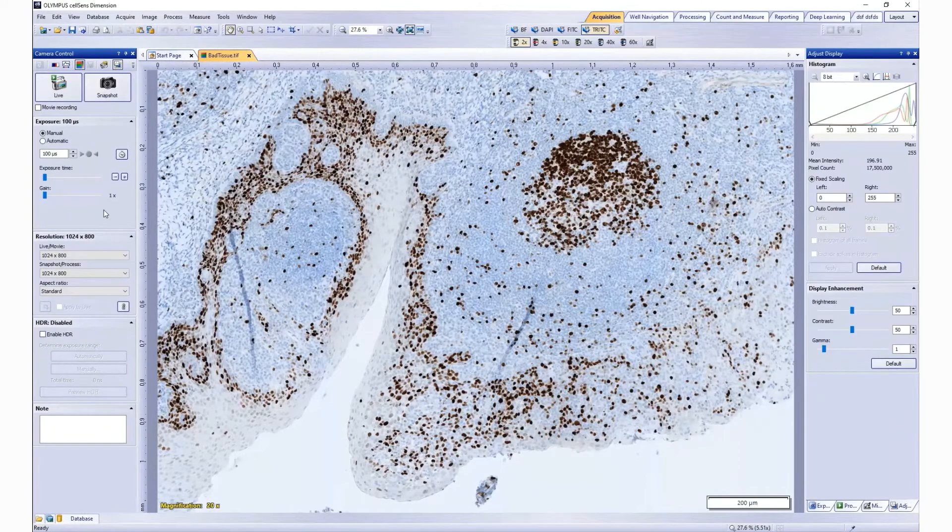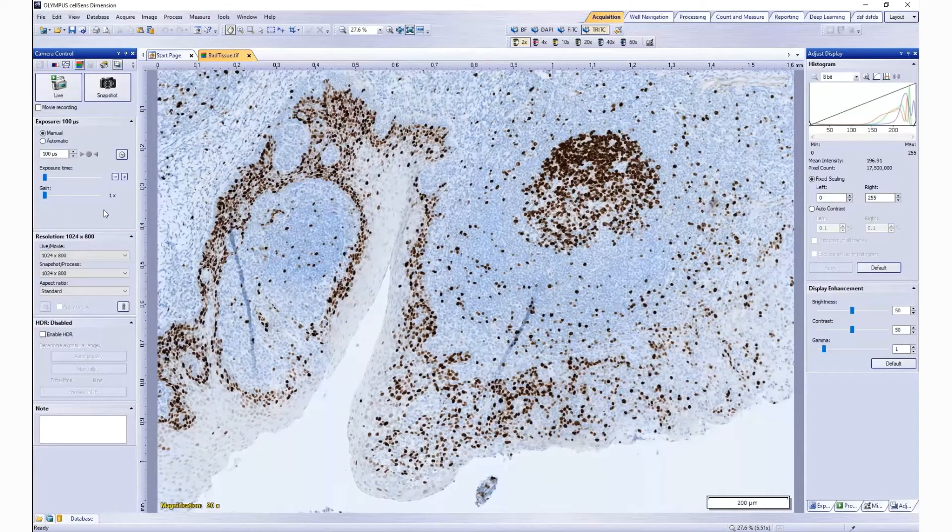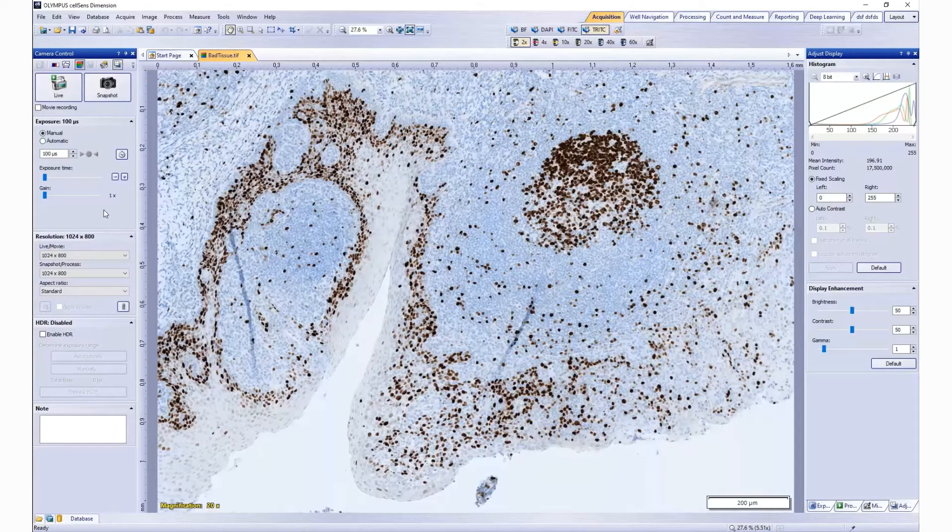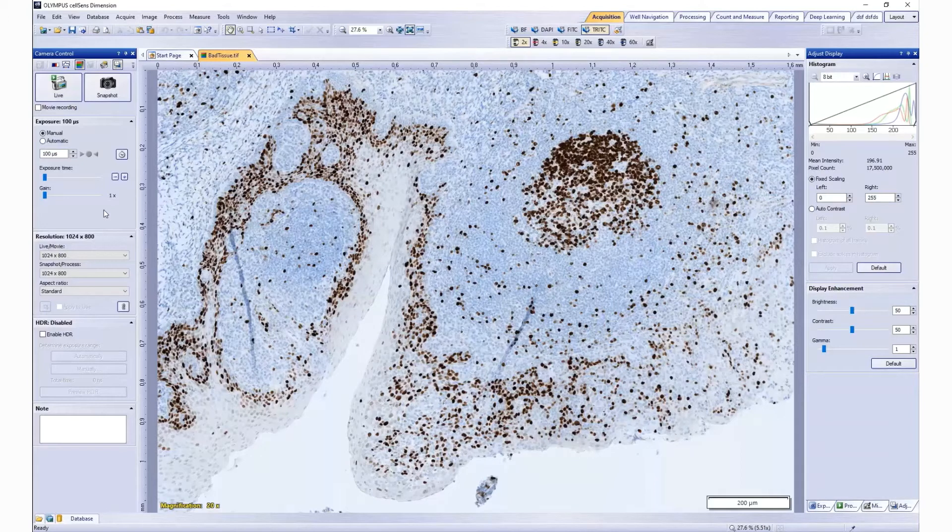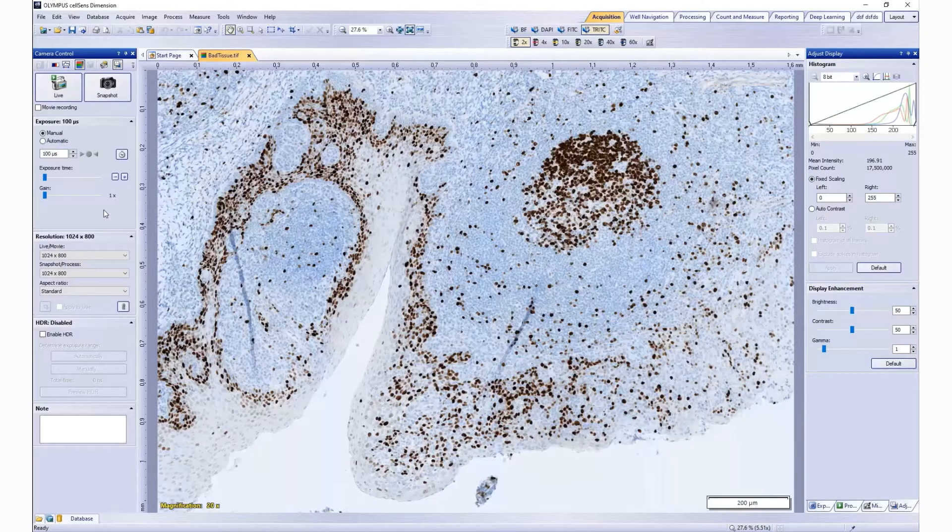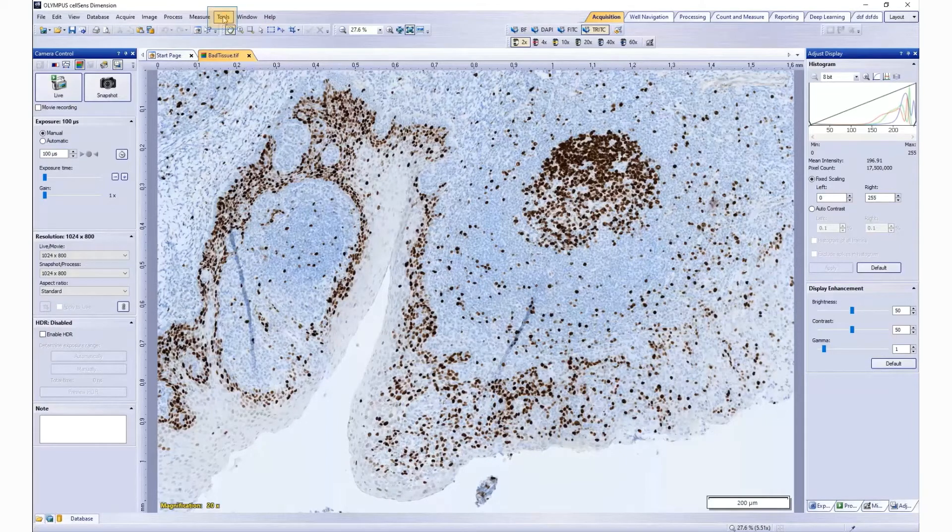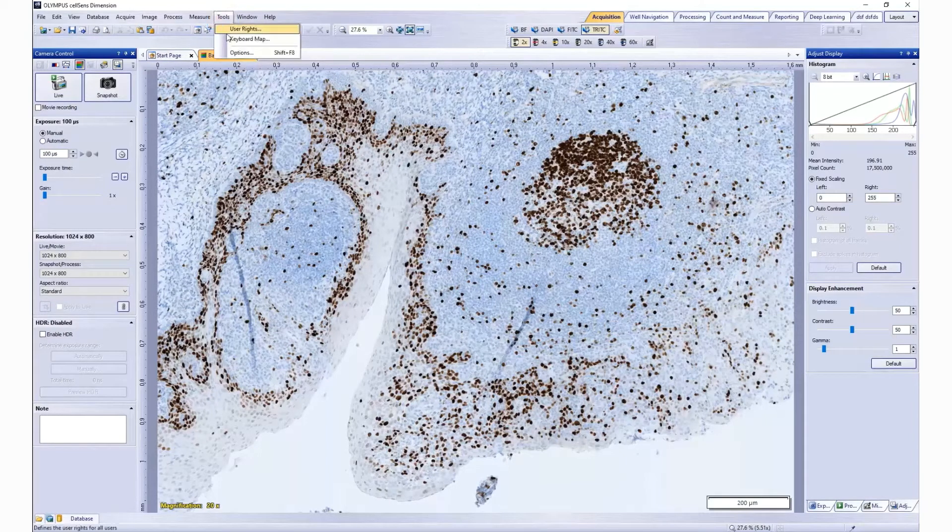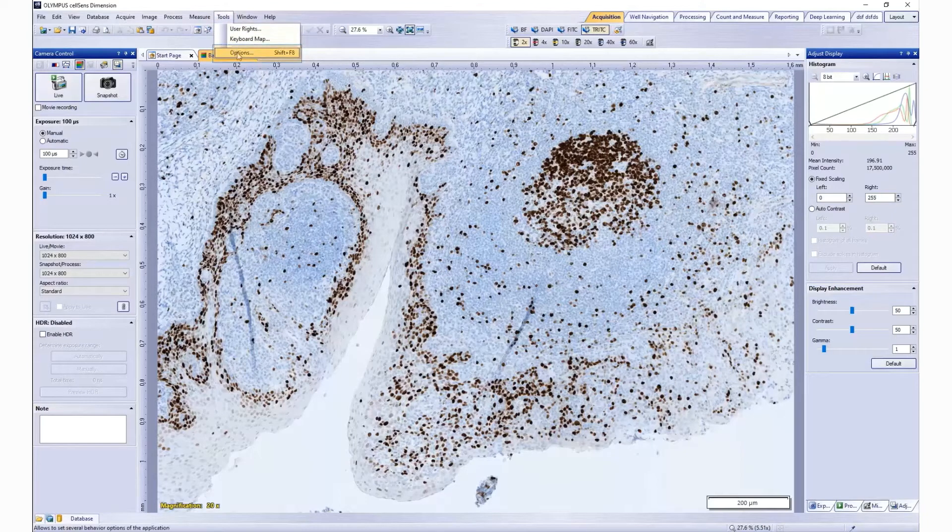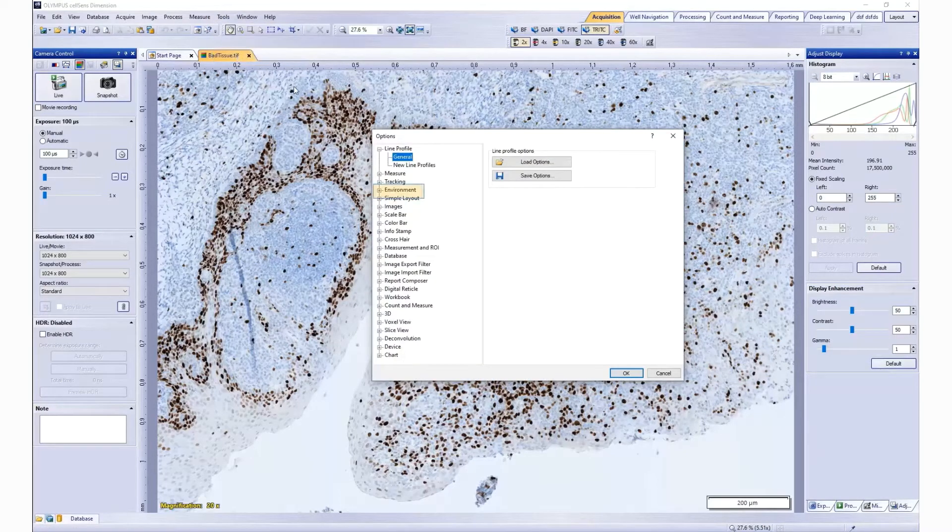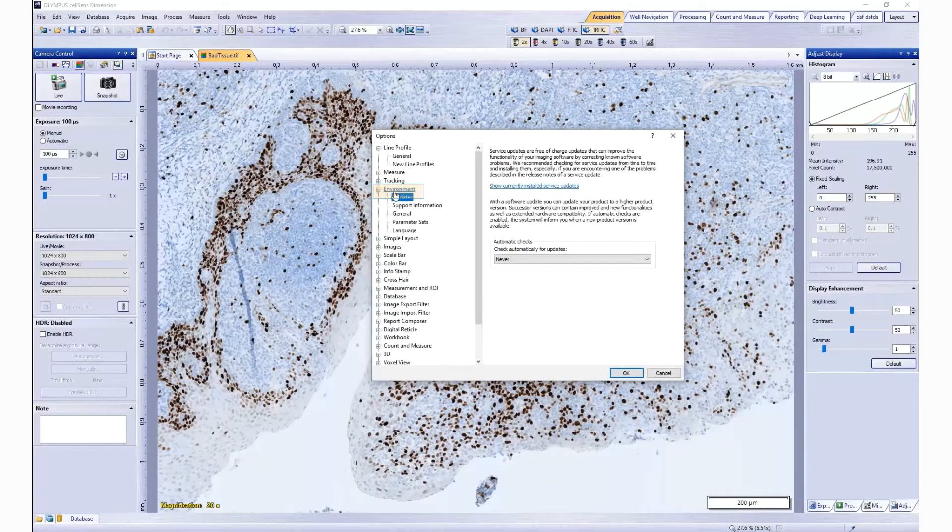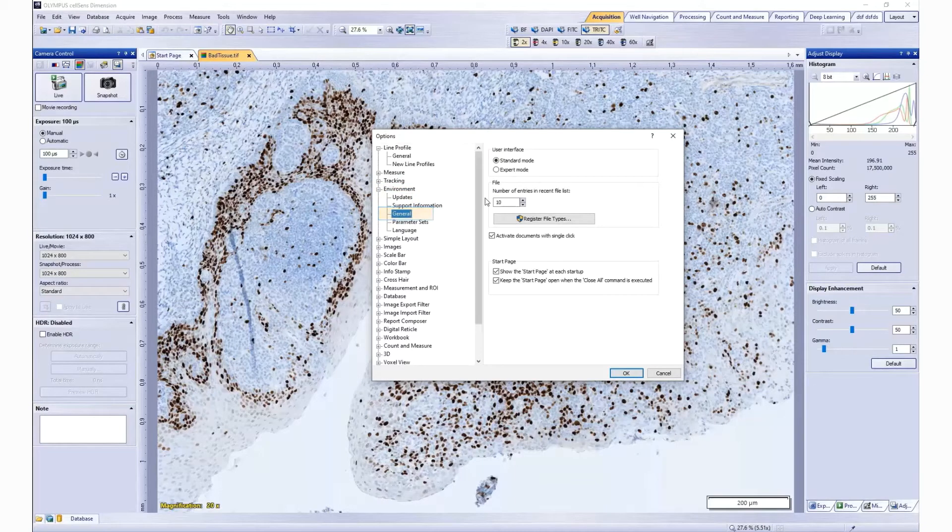Tool windows can be docked, freely positioned, or integrated into document groups. However, you can only position tool windows as you wish when you are in Expert mode. To enable Expert mode, in the menu bar, go to Tools, Options, Environment, General, and select Expert mode.